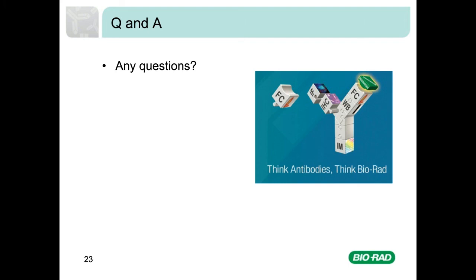And the next question we have is, which viability dye is the best? Well, this really depends on what you're doing. If you don't need to fix your cells, then using a DNA stain such as PI, 7AAD, or DAPI is probably the easiest. However, if you do need to fix and/or permeabilize your cells, then a protein stain such as VivaFix is what you need. If you're doing a multicolor panel, you may also find that the greater range of fluorophores in the VivaFix range are an advantage.